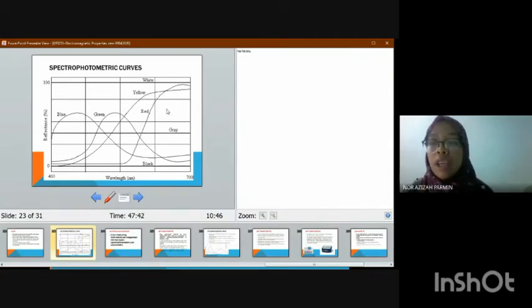Selalunya kamu akan kena pakai juga UV visible spektrofotometer. So bila kamu scan rate daripada 400 hingga 700, kamu akan dapat peak. Ni, yang rate tu. Okay, so dia ada perbezaan di situ. Kalau tumbuhan macam green, macam sawi, okay, sayur, this one you need to crush it first and in the liquid form, baru you can analyze the color contents based on the spectrophotometric curves. Okay, kalau kamu ambil terus ni, masuk tak boleh measure. Dia kena memang dalam bentuk solution.